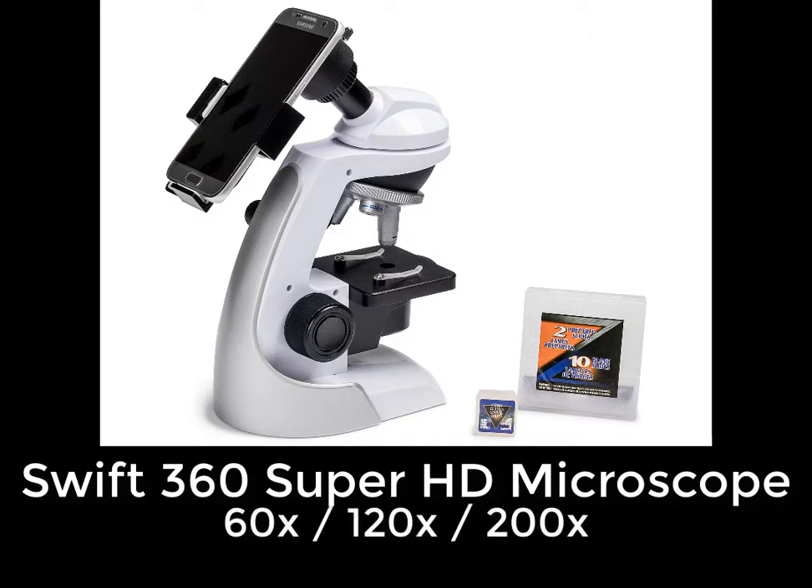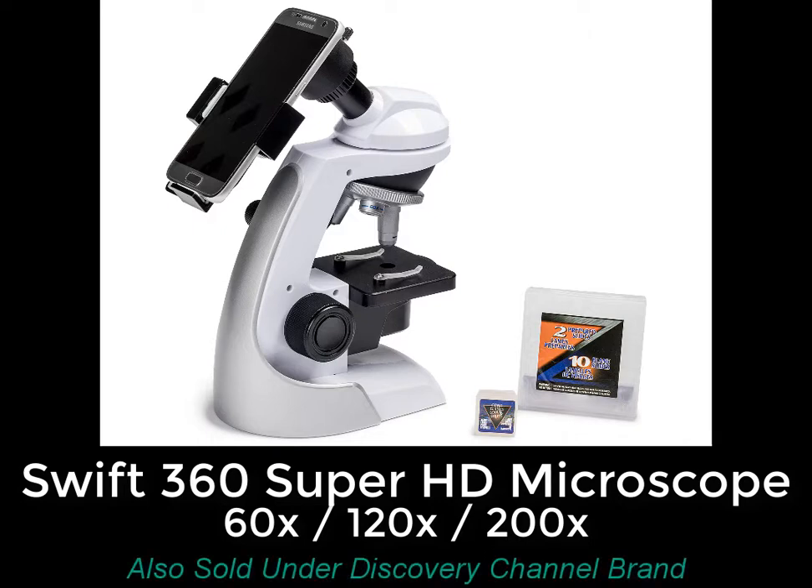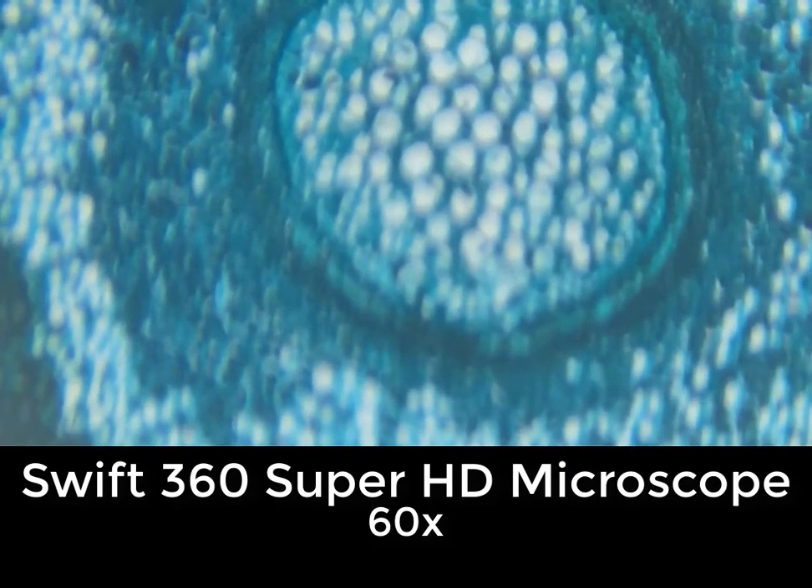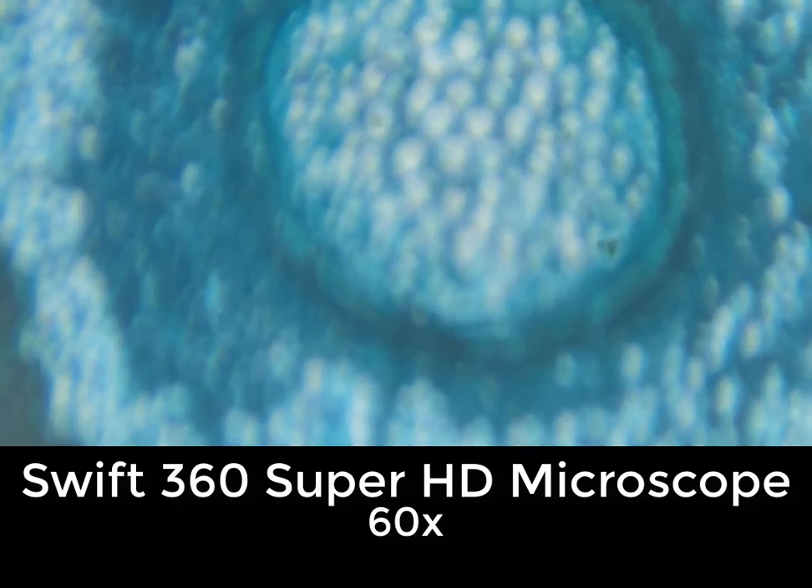It's the Swift 360 Super HD Microscope, and it comes with a smartphone adapter. This microscope offers three different powers: 60 power, 120 power, and 200 power. It's also sold under the Discovery Channel brand and other brands. In addition to the smartphone adapter, it also includes some other accessories, including two prepared slides to allow you to get started.